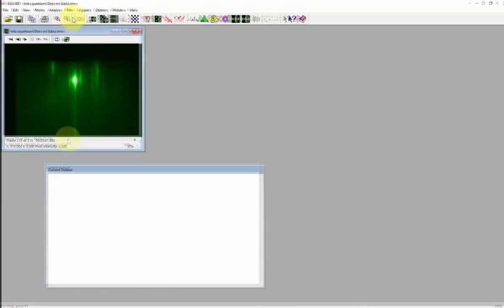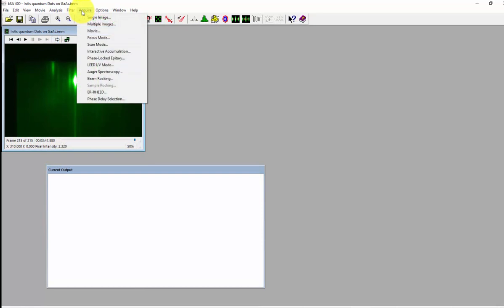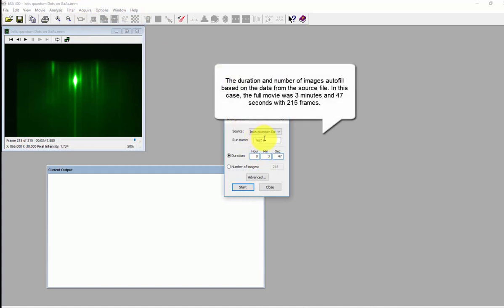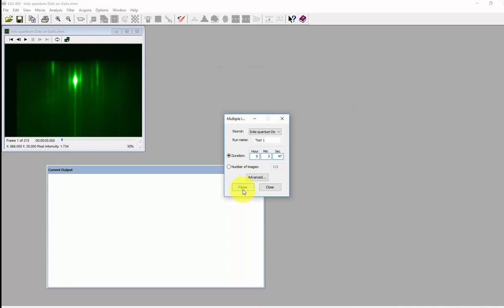Next, click on the acquire menu at the top of the screen. Choose multiple images and a new menu will pop up. Enter a run name and any other options if you like, then click start.